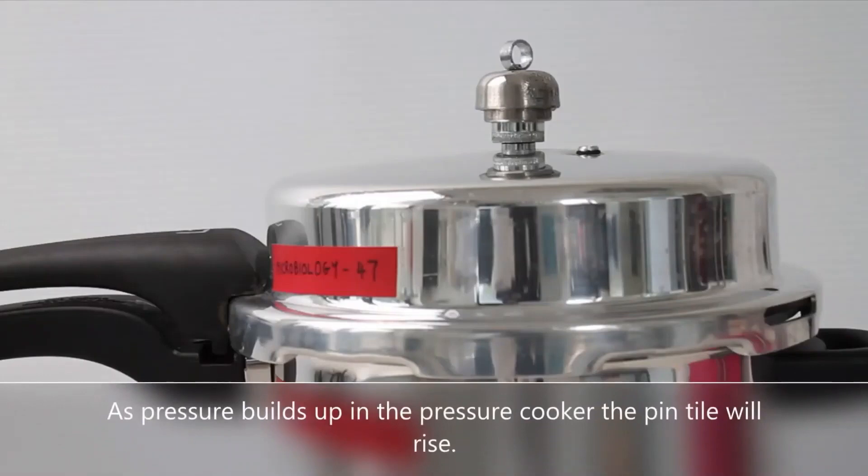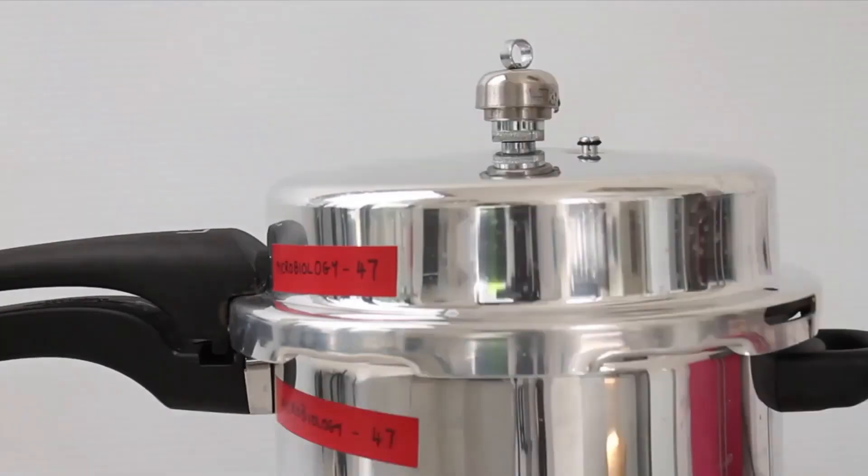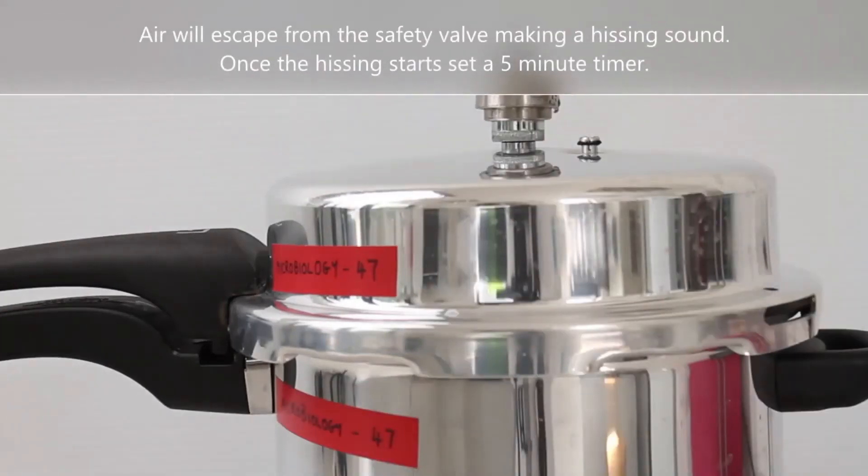As pressure builds up in the pressure cooker, the pin tile will rise. Air will escape from the safety valve making a hissing sound. Once the hissing starts, set a 5 minute timer.